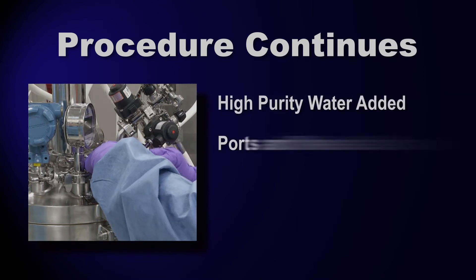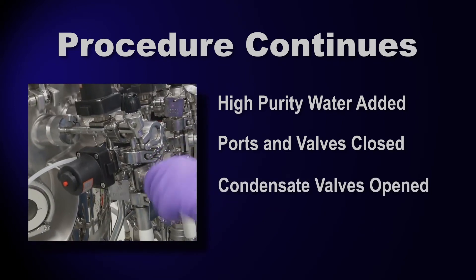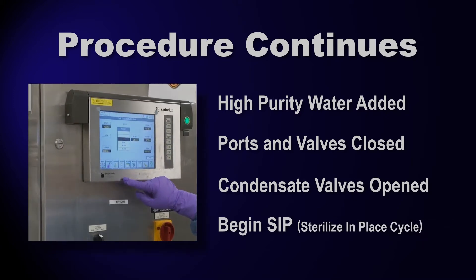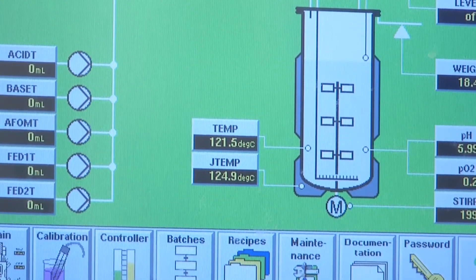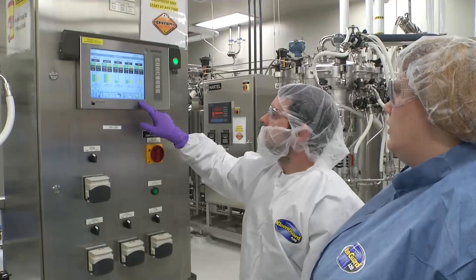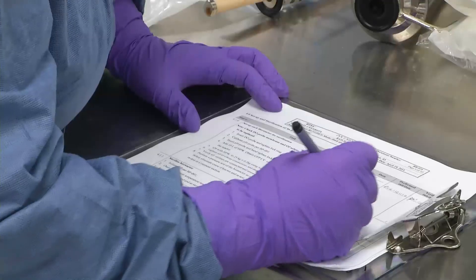All ports and valves are closed, all condensate valves are opened, and the bioreactor begins an SIP — sterilize in place — cycle. The target for sterilization is 121 degrees Celsius for 30 minutes. As soon as that target is reached, the condensate valves are closed and the SIP cycle completes automatically.